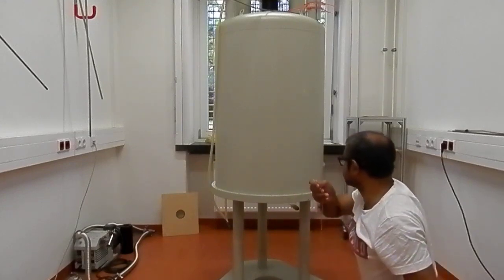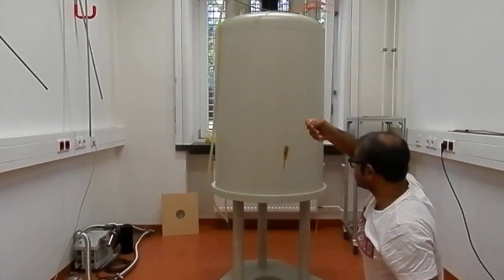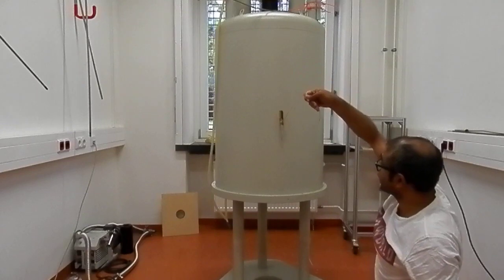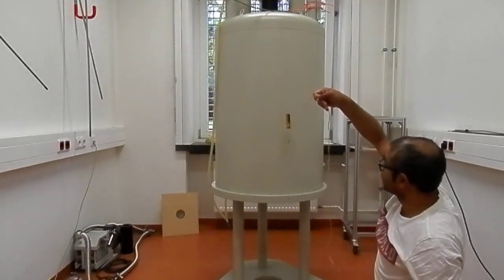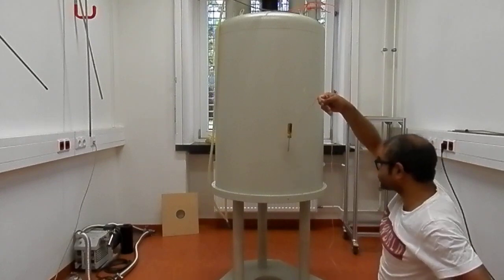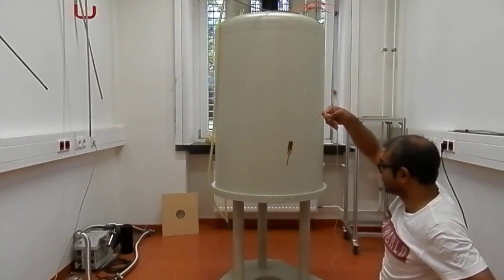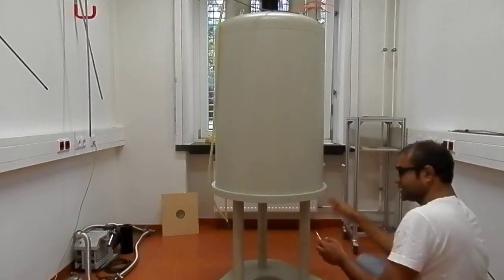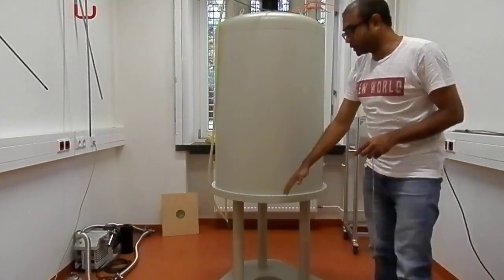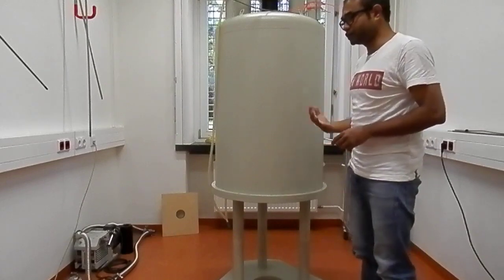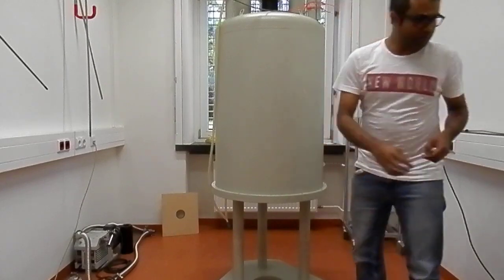Against gravity, it's working and moving—this is the field that is hitting. In that way, you can see how strong the magnetic field of the 7 Tesla homogenized magnet is. The problem with this kind of magnet is that the stray field is quite strong, so it is not recommended to bring strong magnetic material close to this magnet.